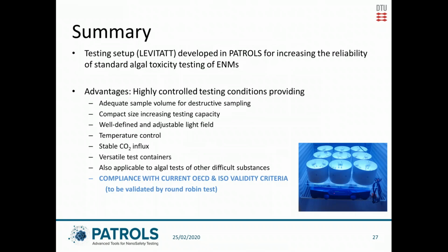So here is a brief summary. Basically, the LEVITATT has been developed in PATROLS to increase the reliability and availability of standard algae toxicity test of nanomaterials. Here is briefly summarized all of the advantages of using the LEVITATT, and basically what these different advantages do is that it will allow us to actually have compliance with the current OECD and ISO validation criteria. This will also be validated by our round-robin test.